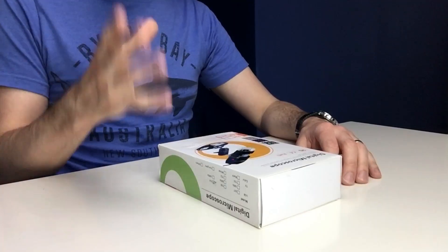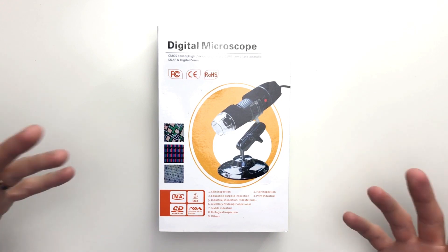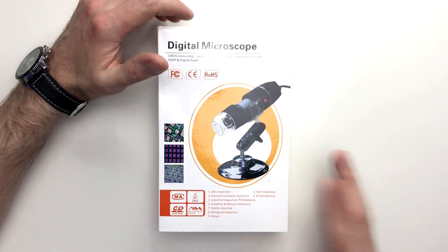Now the reason I ended up with one of these is because if you are like me and you have children, you will know that they are just extremely fascinated by the world around them, but most importantly with insects and bugs. So like any parent, I've decided to take full advantage of this interest and with one of these I'm hoping he'll be able to gain a valuable insight into just how fascinating life is at a microscopic level.